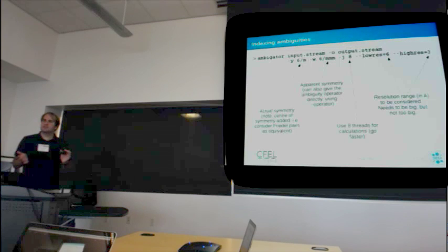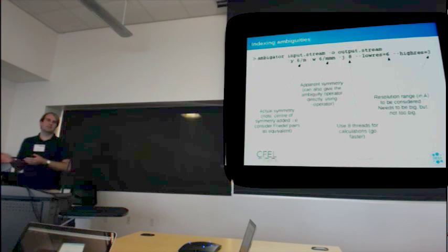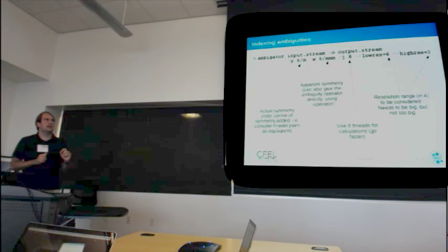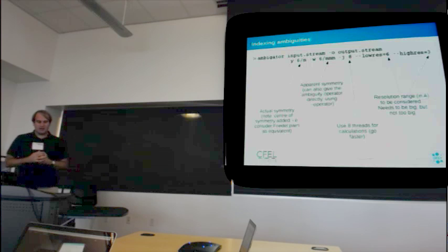If you have a very large resolution range, well, low resolution reflections from any structure are strong. High resolution reflections are weak. That's just the normal scattering factor. That will give you a certain amount of correlation, even if the orientation is wrong. So by restricting the range, you look at a narrow shell of reciprocal space where that fall off isn't so severe, and that can then help the contrast between the right and the wrong orientation. So just play with this.